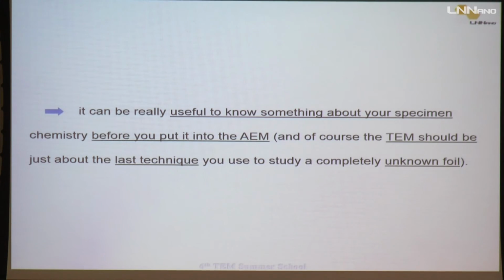But as I told you, it's very important to know a lot about your experiment before going to analytical electron microscopy. TEM should be the last technique to be used in a project you are working on.